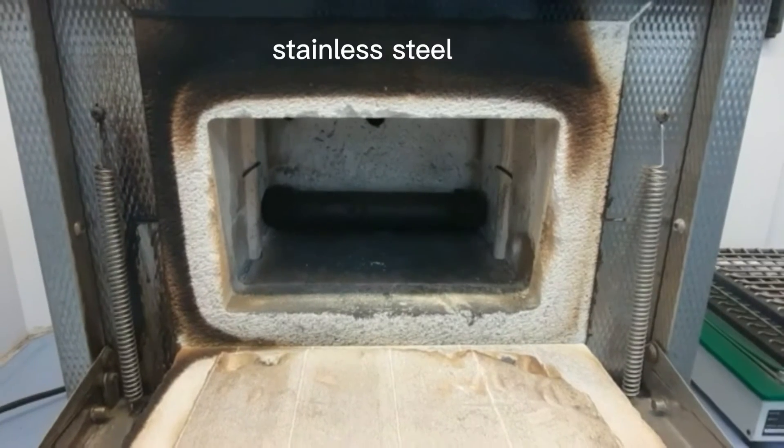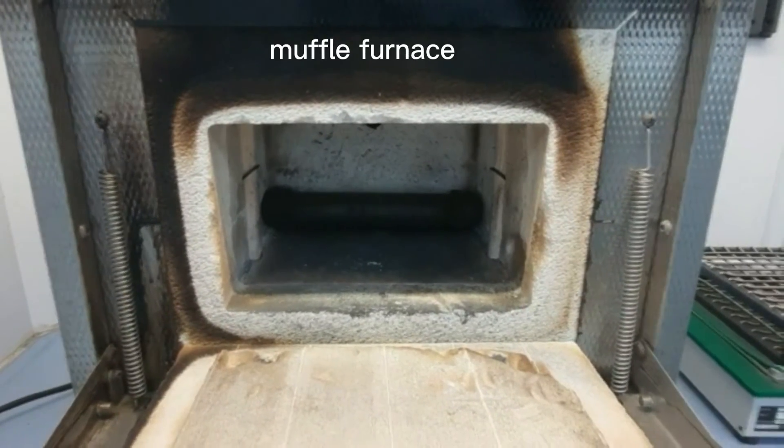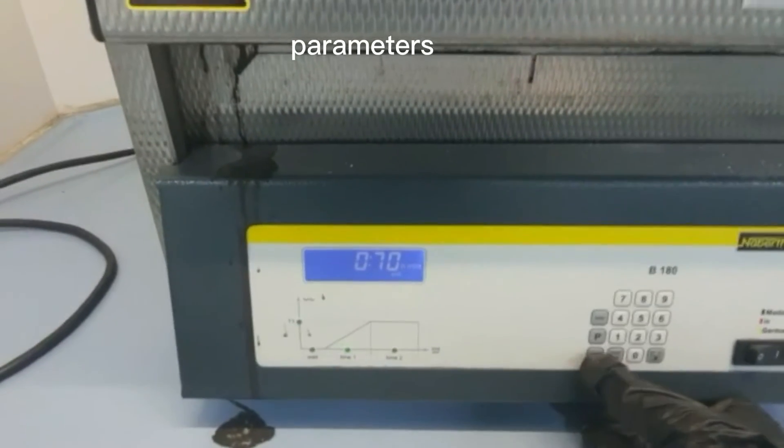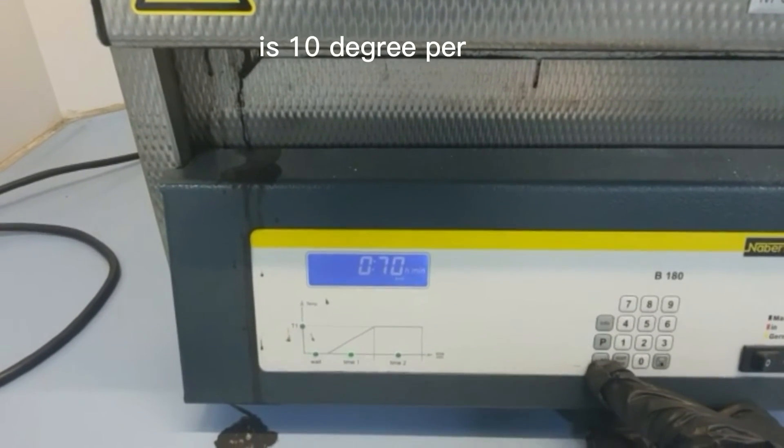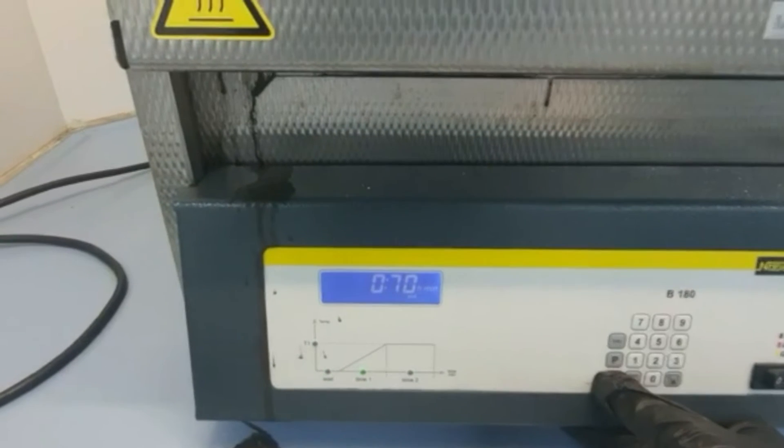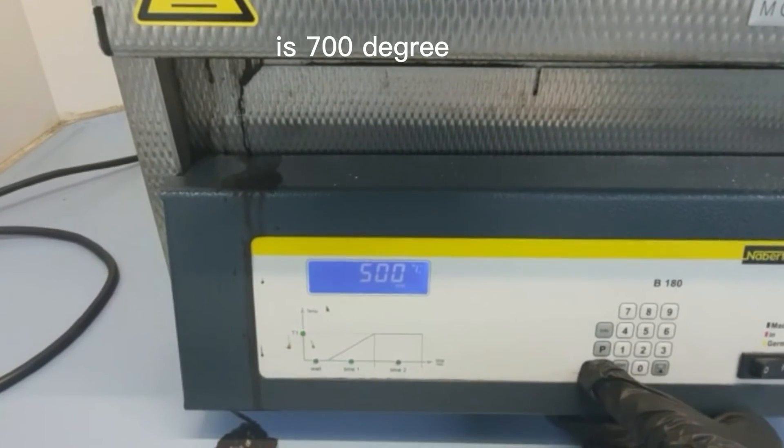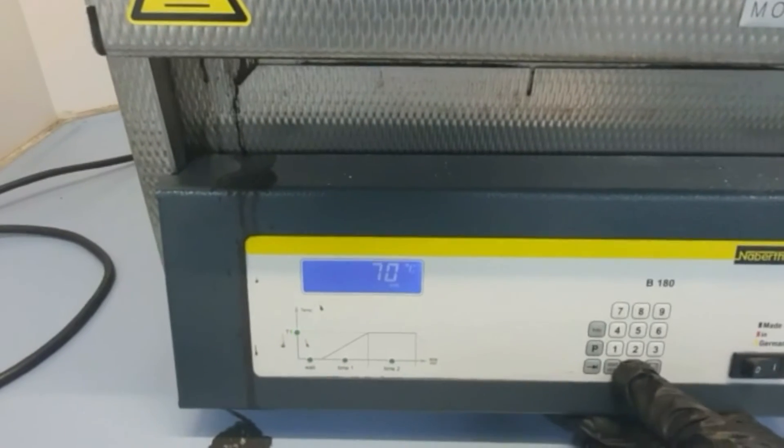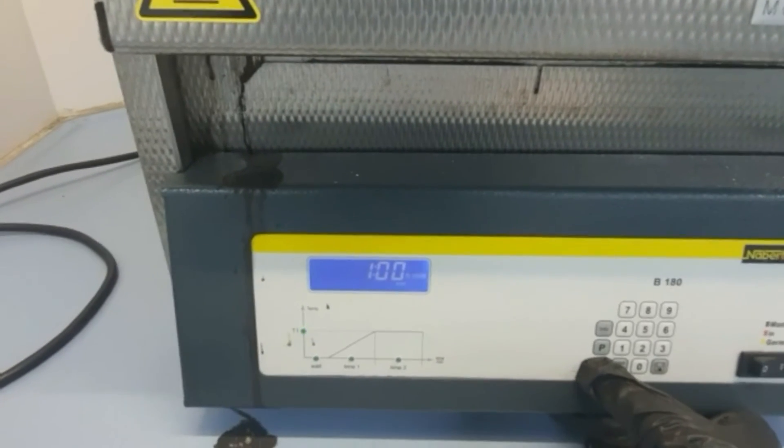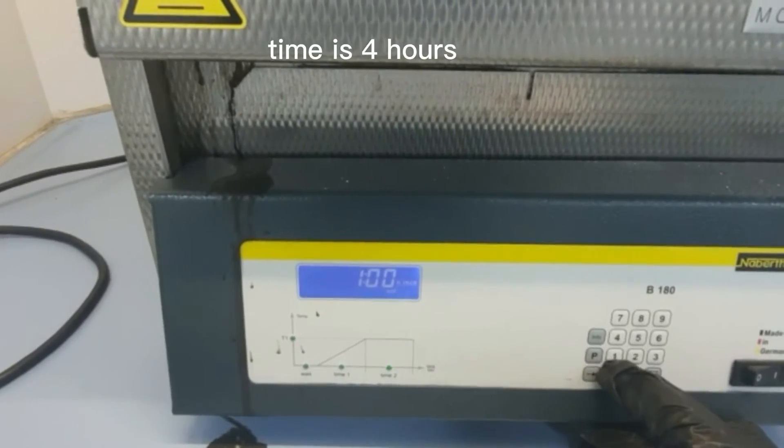Transfer the stainless steel tubes into muffle furnace. Now set the pyrolysis parameters: the heating rate is 10 degrees per minute, the heating temperature is 700 degrees, and the heating time is 4 hours.